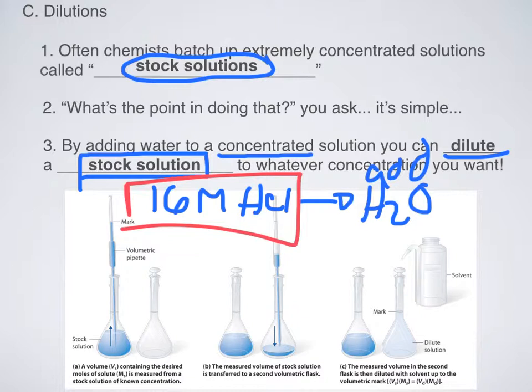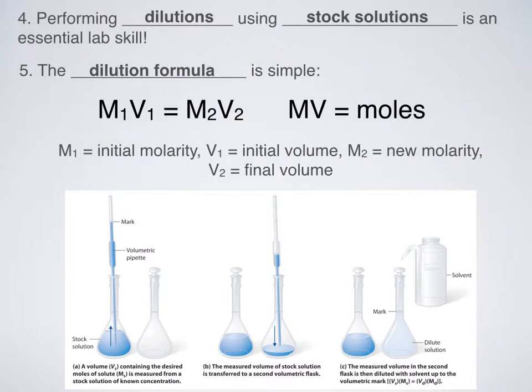And obviously we don't want to be wasteful. Concentrated stock solutions are very expensive. How exactly do we perform dilutions? Well, performing makes it sound like you're going to play an instrument or something, but performing dilutions is a standard lab skill that you're going to be using quite a bit, especially in this unit, but also in the next couple.